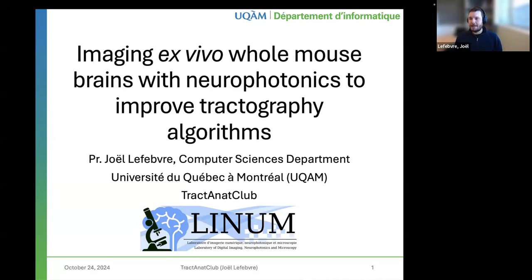As Francois said, I'm a professor at the Université du Québec in Montreal in the computer science department. I'm also the director of the LINUM, the Laboratory of Digital Imaging, Neurophotonics, and Microscopy that I founded in 2020 when I arrived at UQAM. My talk today will be about imaging ex vivo whole mouse brains with neurophotonics to improve tractography algorithms.